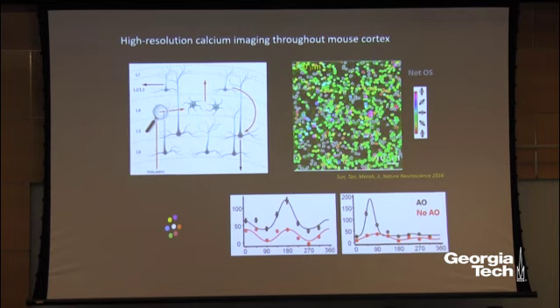So those are the boutons. It's just a cartoon of boutons, where this axis is imaging depth. Because this is a mouse, it does not have a so-called orientation tuning column. So the boutons in here actually have different tuning, different preferred orientations. When you do not use adaptive optics, you will have a big, enlarged focal volume. Even though you think you are imaging the response of the bouton at the very center of your focus, your signal is actually contaminated by the structures above and below the bouton right in the middle. Because they have different tuning properties, as a result of this averaging, you will have a broadened tuning curve.